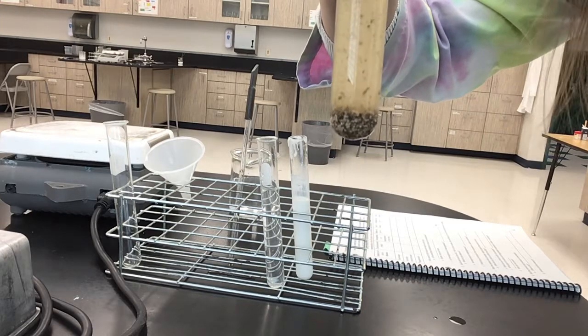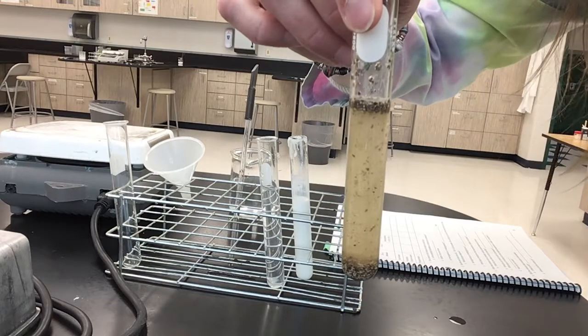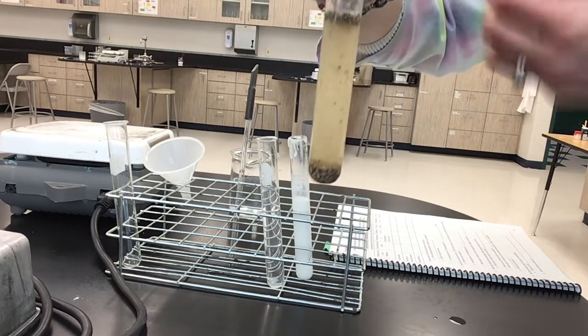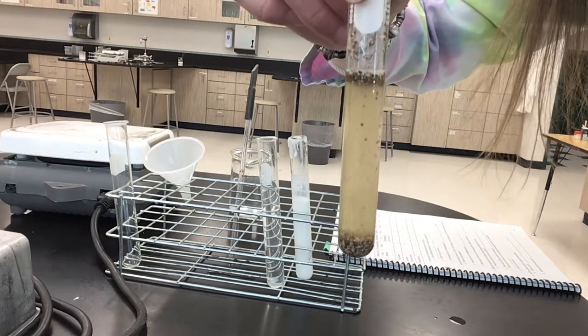It's a little bit of both clear and cloudy, so certainly you can just record your data there. It scatters light because you cannot see directly through it. This is definitely a heterogeneous mixture.